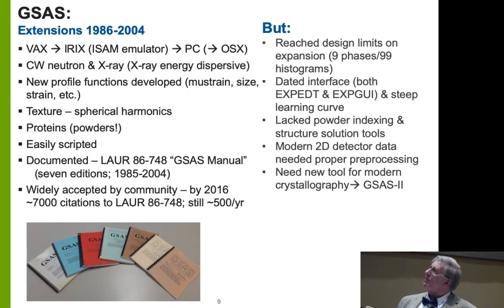But the problem is that it had reached design limits. You simply couldn't expand it beyond 99 histograms, 99 powder patterns. The interfaces were dated, difficult to use, and clearly there was a steep learning curve for both of them, particularly for the first one. And it lacked all the kinds of tools that you need for solving structures.